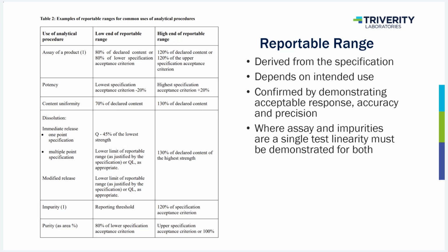Dissolution, this is about the only time we're going to talk about dissolution because it truly is its own beast. I don't want to get into this because it would take up time, and we're already probably going to go late. If you're interested in dissolution, I highly recommend going to the Agilent website. Agilent has an expert in dissolution, Ken Boda. He's got a series of dissolution videos, probably 30 of them, including a core dissolution series on method development, method validation, and qualification of your dissolution apparatus and everything like that.